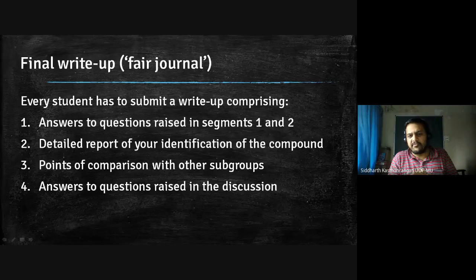And of course, if you do 3 experiments in the lab, one in NMR, one in IR, and one with mass spectroscopy, you will not get the feel which you will get when you do this particular activity. So this gives you something beyond what you would have got when you would have done the experiment hands-on.